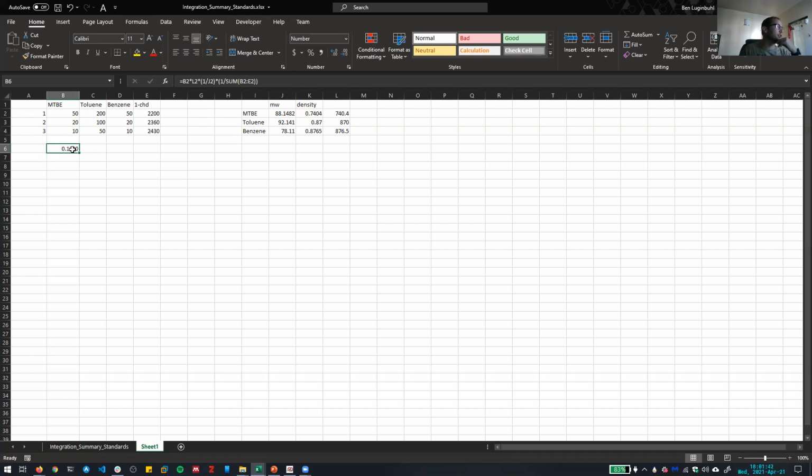We want to apply it to the other rows here. So we need to go through here and make sure that we lock the correct cells so that the formula can be applied correctly, right? We want to be able to drag this down and across potentially, but let's first work on down.